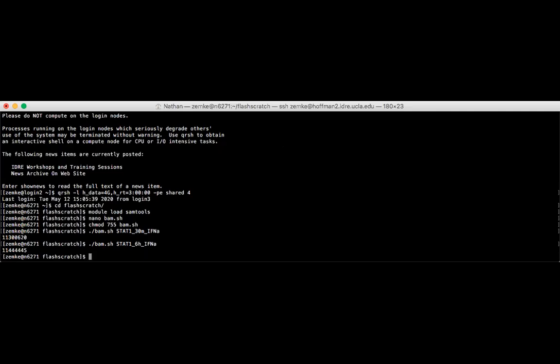All right, so the second one finished, and there's 11.4 million reads. Next, we're gonna do the same with the input files.